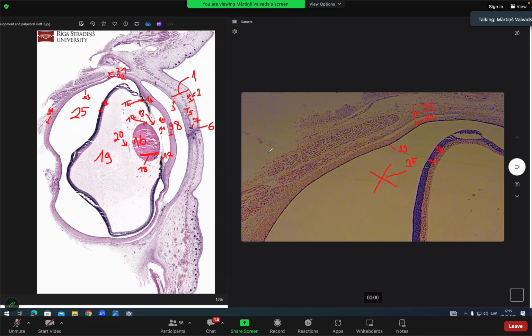During embryonic development, we see during slide preparation, as the tissue shrinks, the neural retina typically detaches itself from the pigment retina. This is one of the rare cases where we see an artifact in slides. Intraretinal gap, remember this. There's some clinical significance to it also.